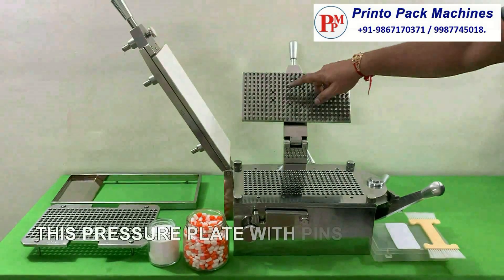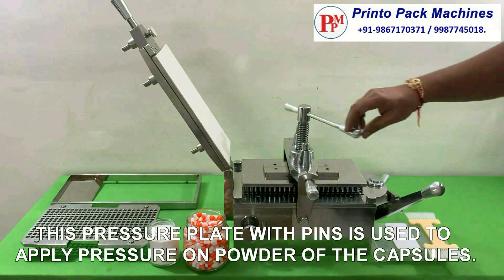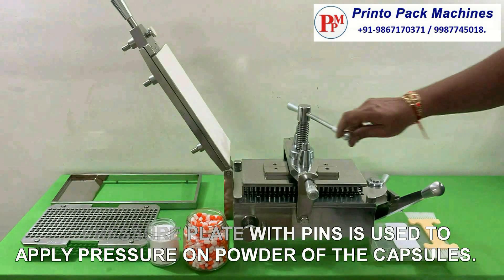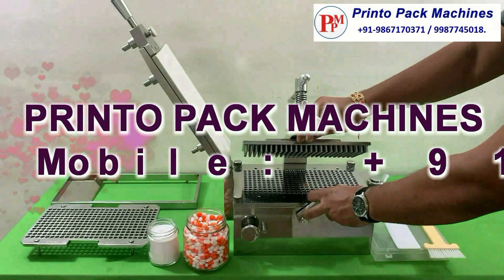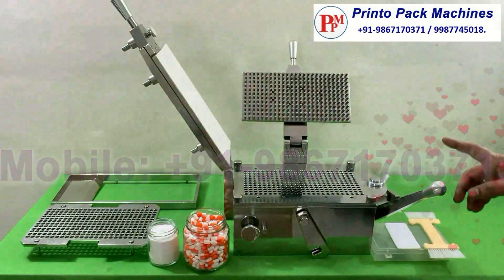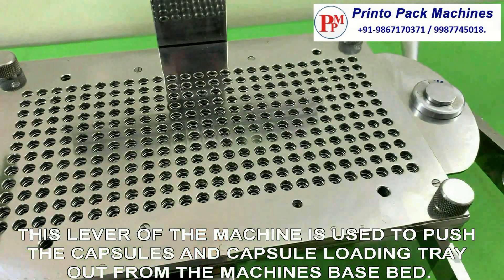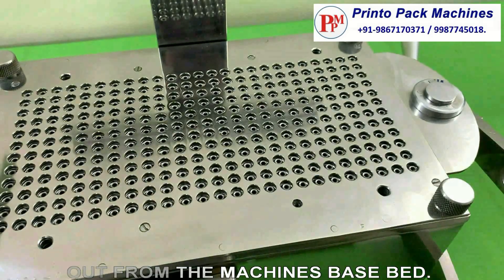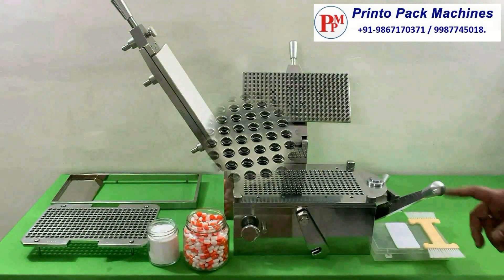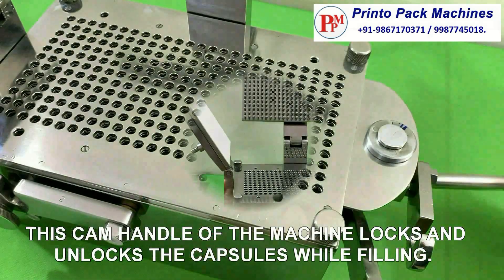This pressure plate with pins is used to apply pressure on powder of the capsules. This lever of the machine is used to push the capsules and loading tray out from the machine's base bed. This cam handle of the machine locks and unlocks the capsules while filling.